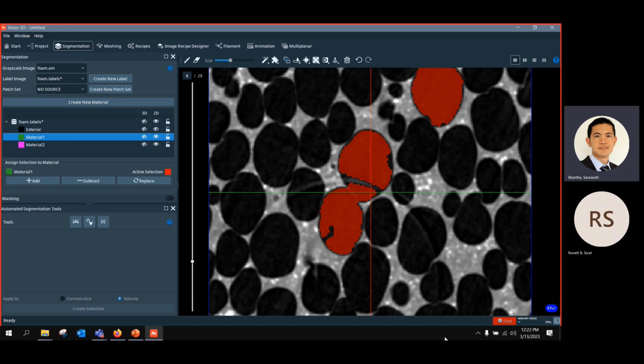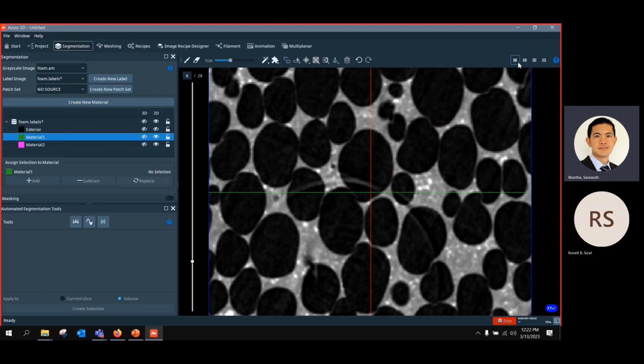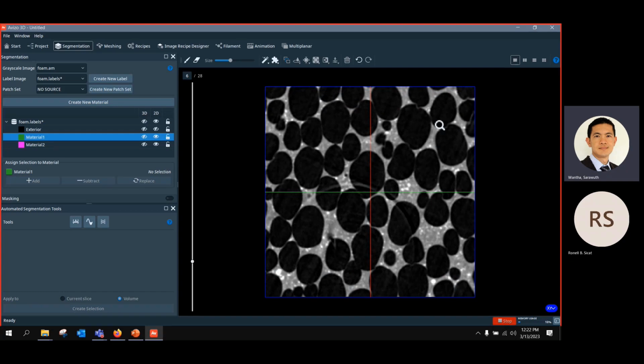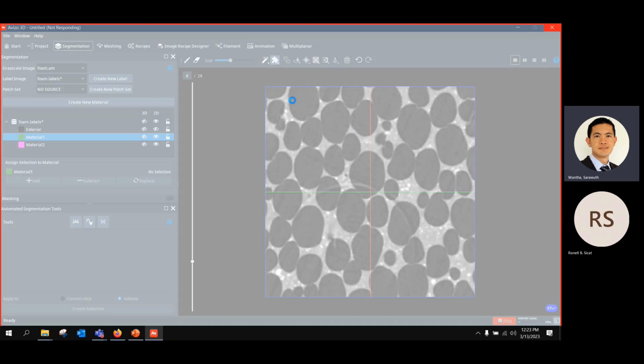And the last tool here on top that I want to present is called Super Pixels. Just clear everything. Look at it like this. Okay, so for Super Pixels, you need to activate it by pressing here and selecting the cell size. It's going to take a little while to activate for the first time.